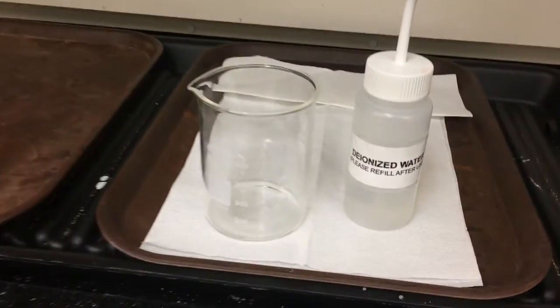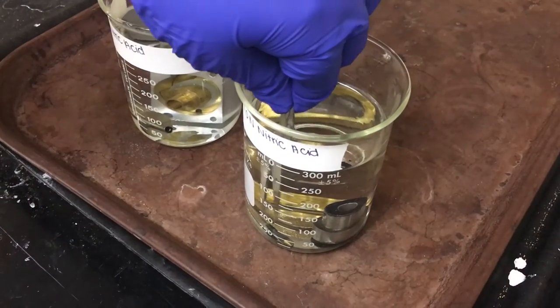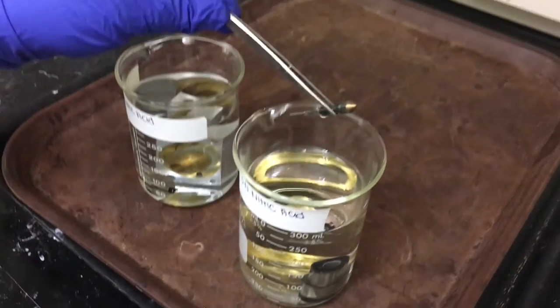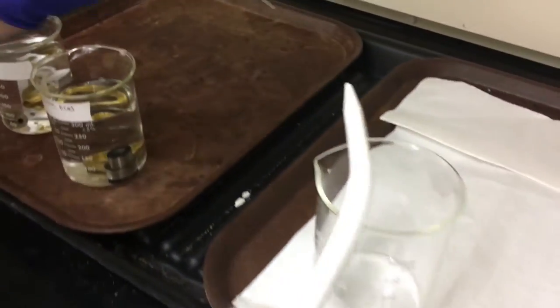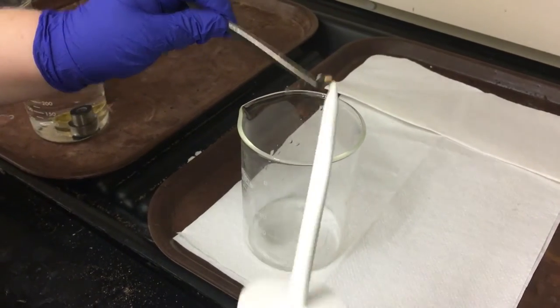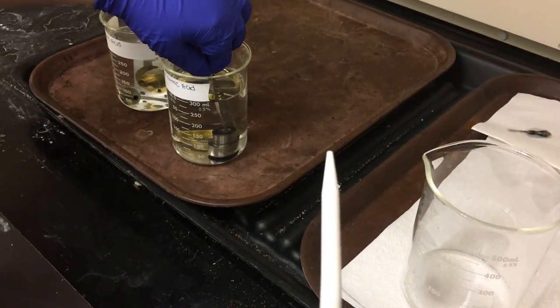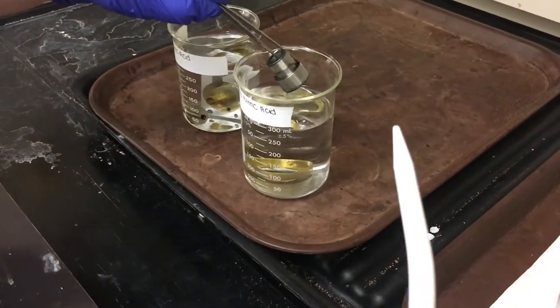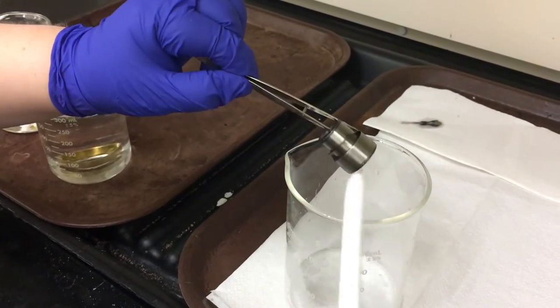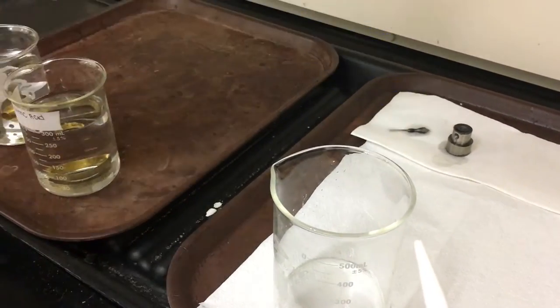After a half hour has passed, remove all of the pieces from the nitric acid and then rinse them with deionized water.